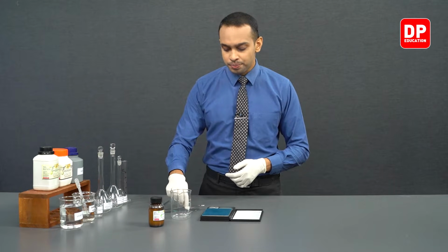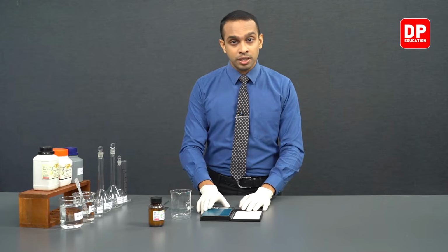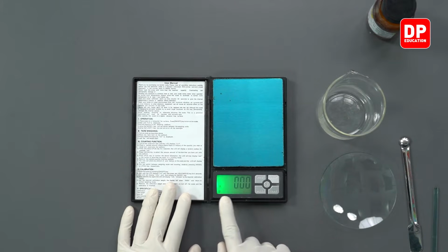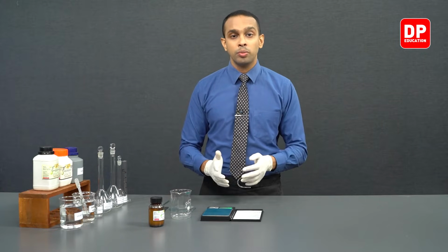So we are going to measure 49.8 grams of potassium iodide with the use of our digital balance. Let's turn on the digital balance. It reads 0, and the unit we are using is grams. Since 49.8 grams is a substantial mass, we are not going to measure it into a watch glass. We can measure it straight into a small beaker, dissolve it sufficiently, and then transfer it to a volumetric flask.